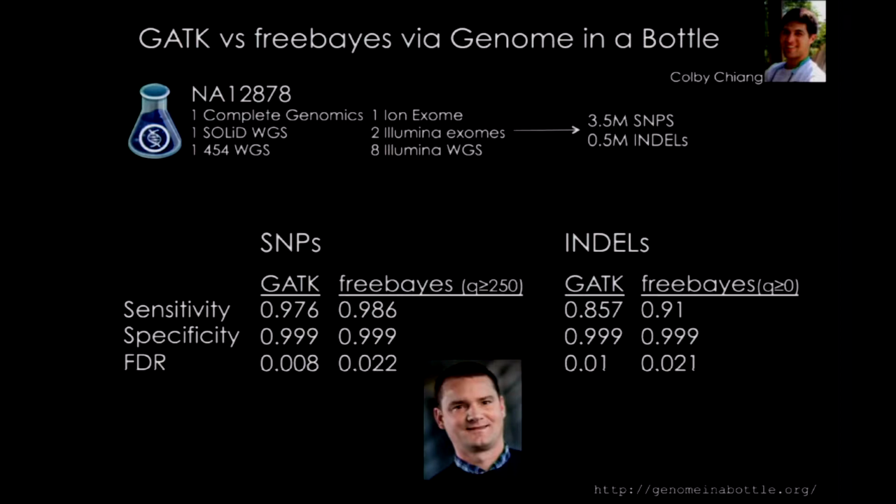Okay, so out of every 1,000 SNPs, you can pick out 980 or so. So it's very high sensitivity, and the specificity is also very good, well over 95 or 99%. So out of every 1,000 variants that you call, only a handful may be wrong calls. Okay, so SNP detection has come a long way, and it's very, very accurate now.